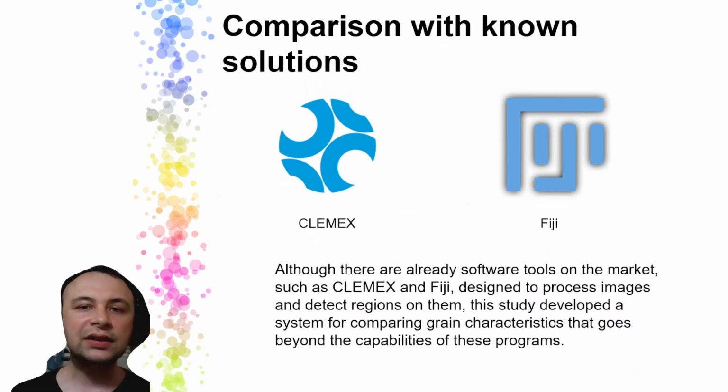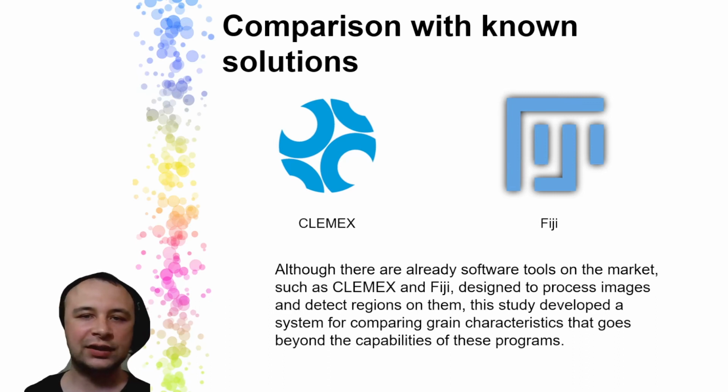There are well-known analogs, image processing tools like ImageJ or Fiji and others. They have similar functionality, but it's very difficult to optimize this processing for a big amount of data, and they do not deal with the specific format we generated for 3D microstructure, like Matvis 3D. So it is important to develop our own algorithm with our own program implementation of such an algorithm.